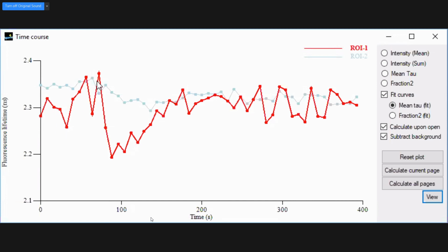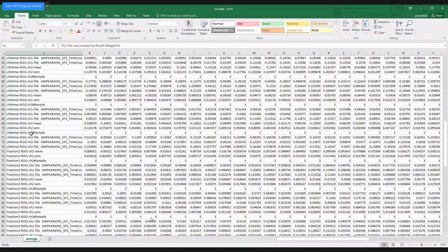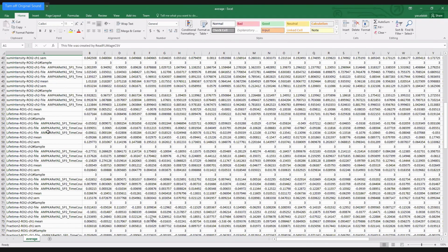When new people enter the lab, I always make them do this manually first so that they know what they're doing. But then once they've done it, they can use this nice automated way of doing it, okay? And when you normalize to this baseline, you're going to have values that basically start around 0.